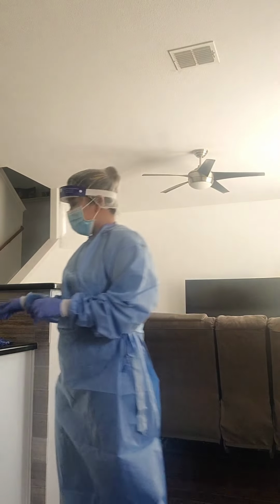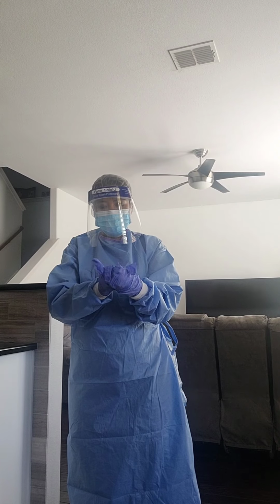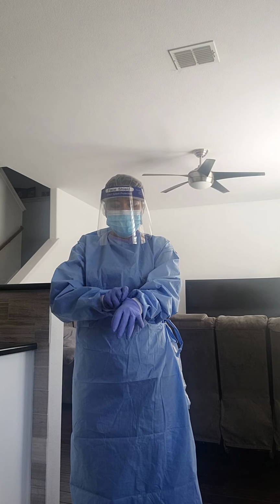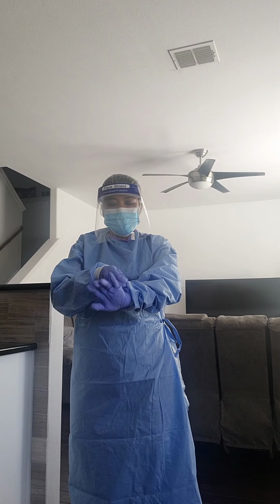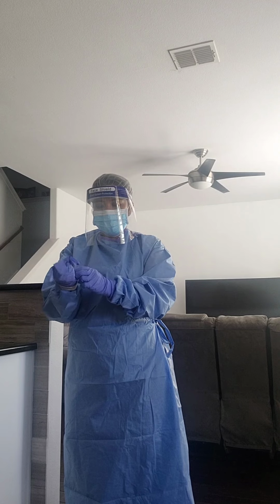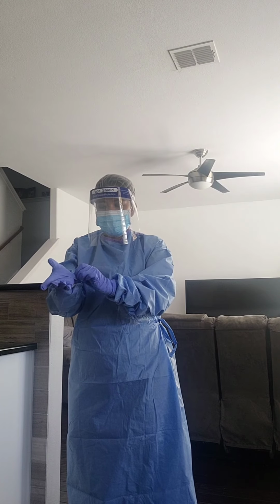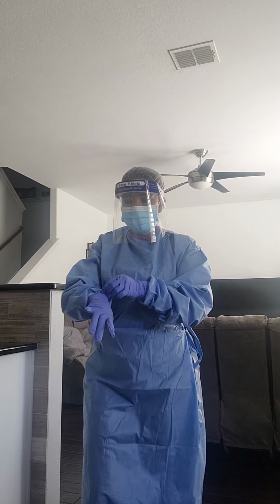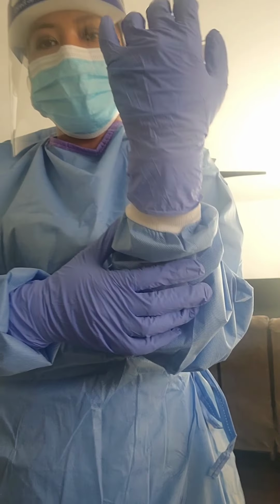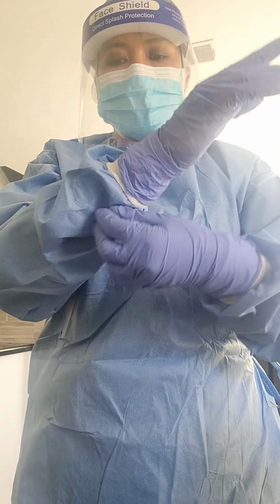Alright, now I'm going to put on the second pair of gloves. And this time, for my second pair of gloves, I'm going to put the edges of the gloves over the sleeves of the gown. And it's my second pair of gloves. I have them over the sleeves. Okay, and that's it.